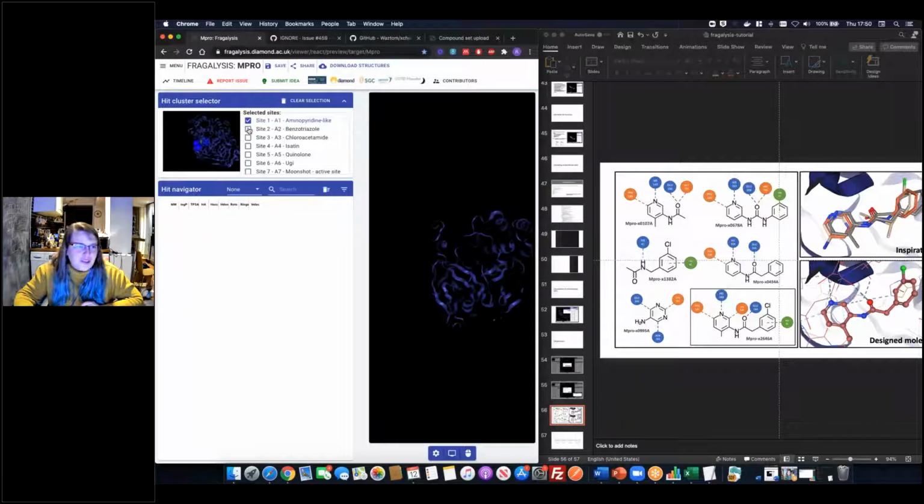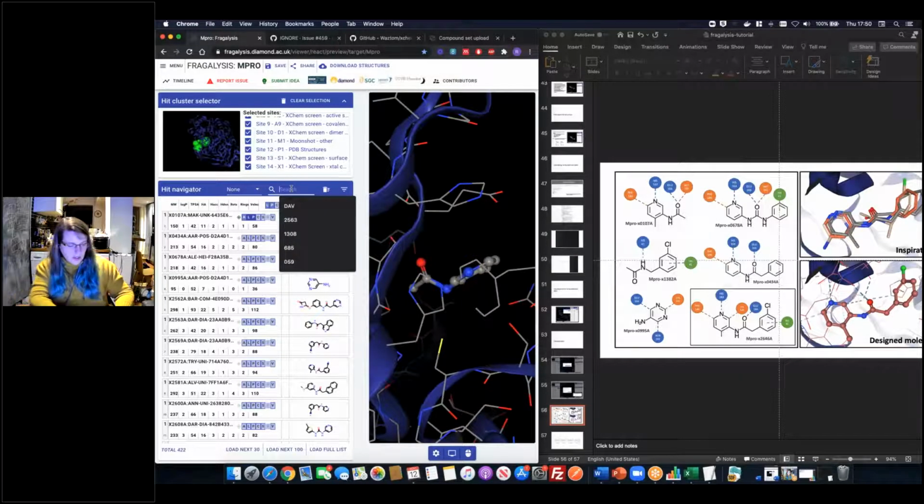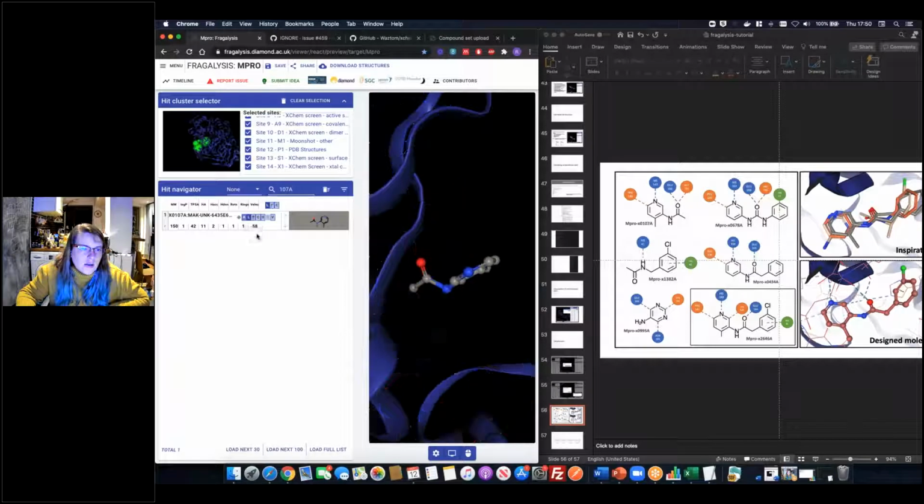Too much computational stuff going on. Okay. I suppose this is how live demos go. And we really need to turn on all sites button as well, is what I've just realized. 107A. So let's turn, that was on anyway. Fantastic. So we've got 107A on.